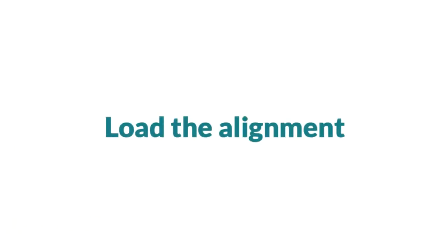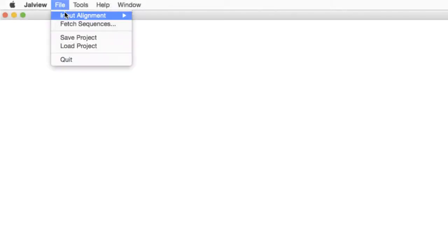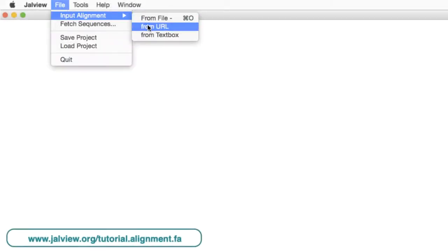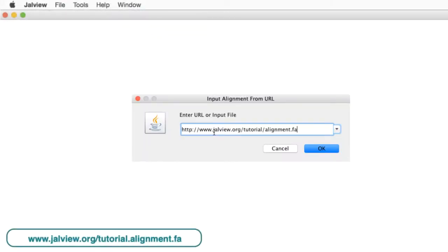I will read a file previously used in the alignment exercise. The URL is shown on the screen and is in the file notes below.